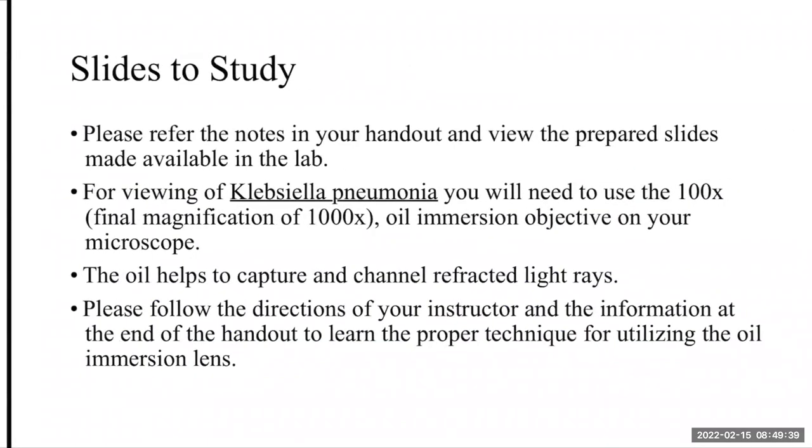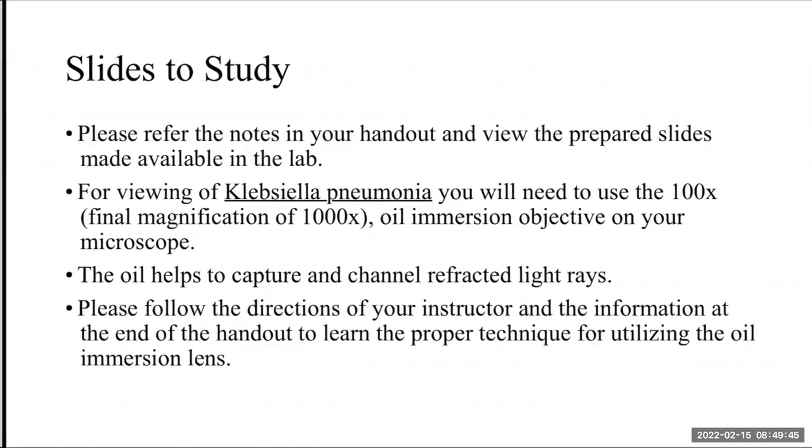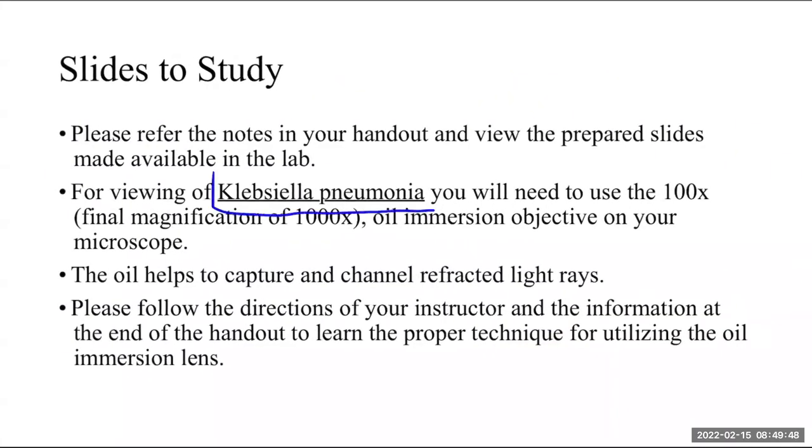So you're going to have a variety of different types of slides to study. For example, you're going to be studying Klebsiella pneumoniae. This one actually is on demonstration in the lab, just because it's really difficult to actually see this one.